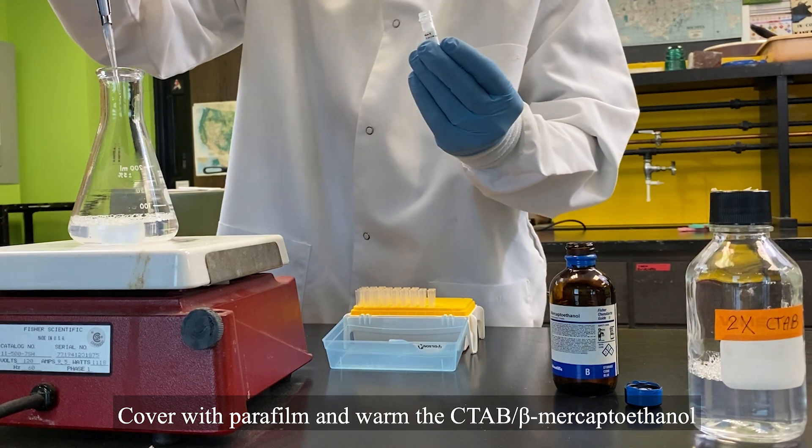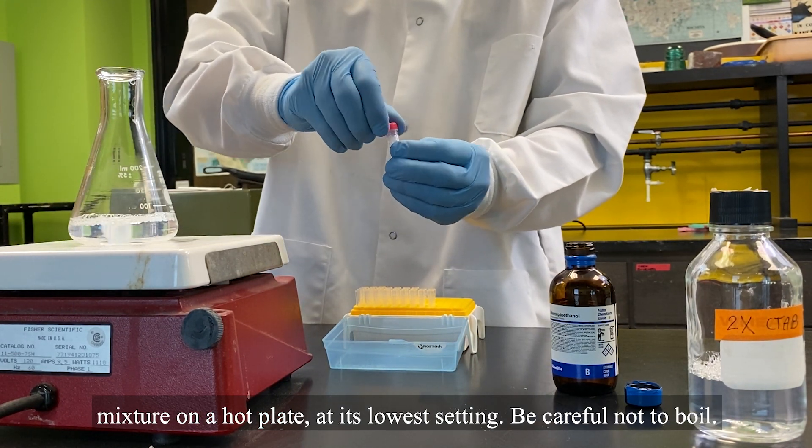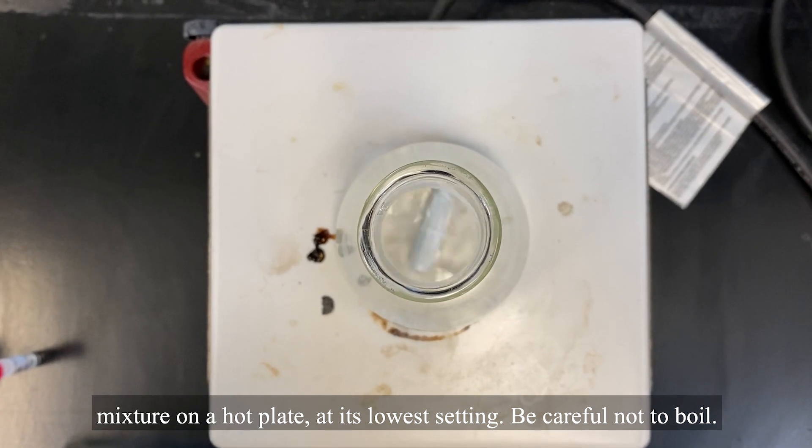Cover with parafilm and warm the CTAB beta-mercaptoethanol mixture on a hot plate at its lowest setting. Be careful not to boil.